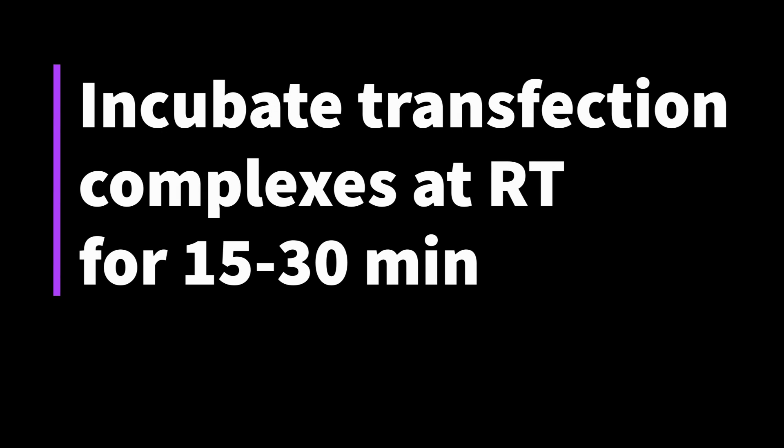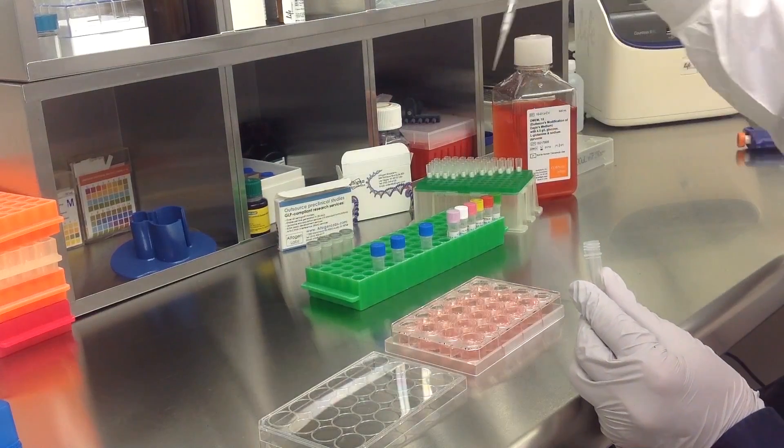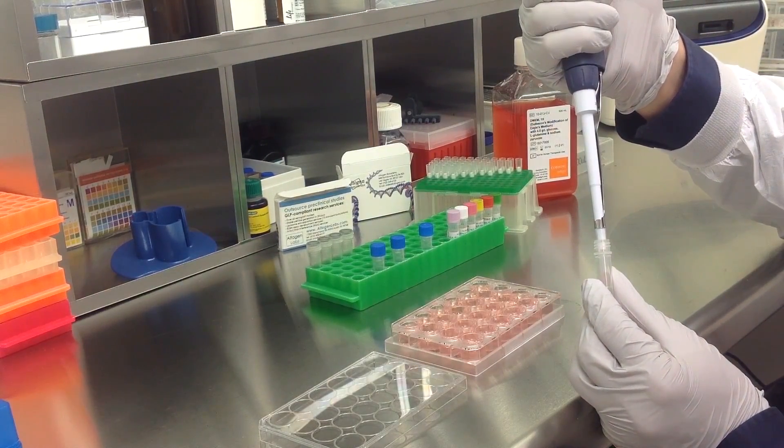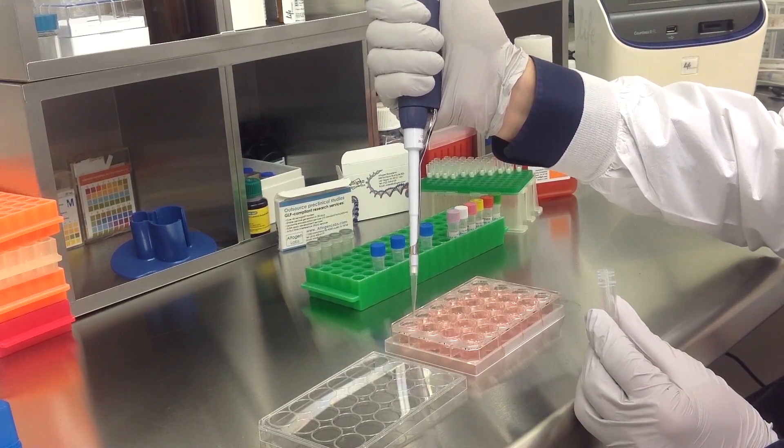Incubate the prepared transfection complexes at room temperature for 15-30 minutes. Then add the prepared transfection complexes to the 500 microliters of complete growth medium.